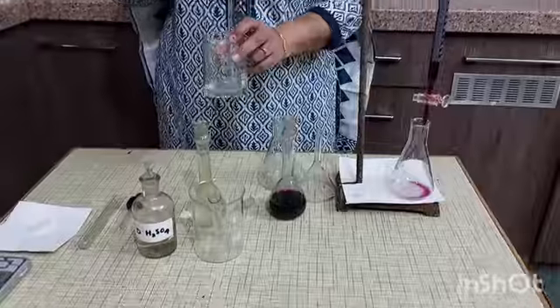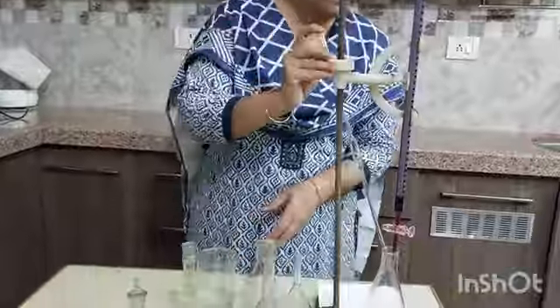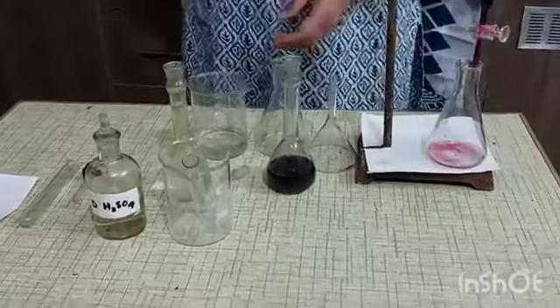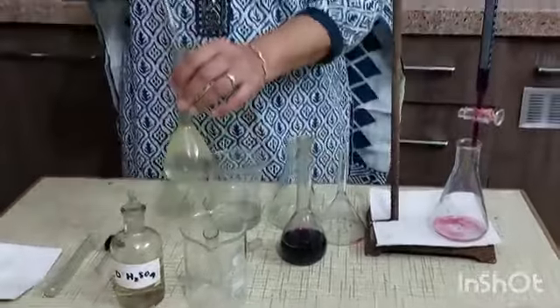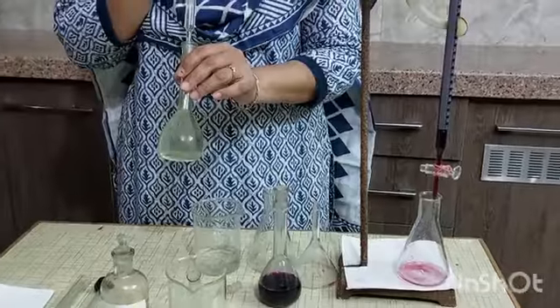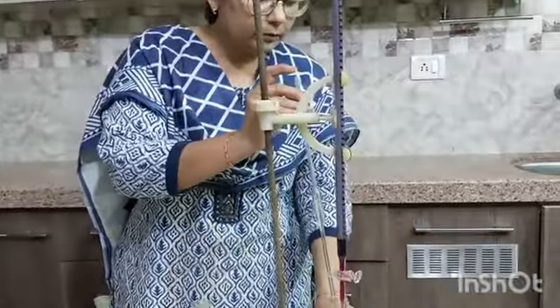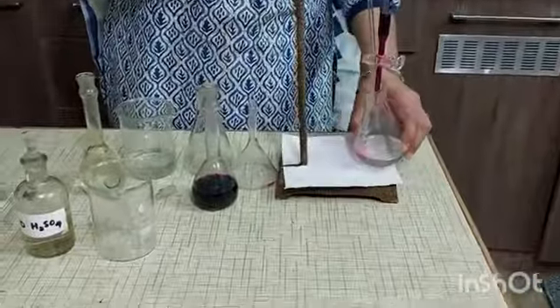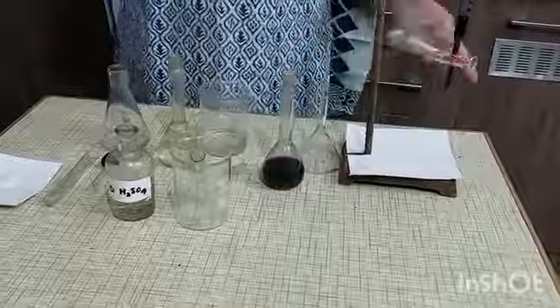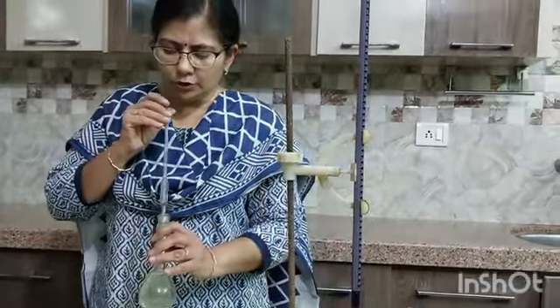Rinse the pipette with water. Then rinse with the known solution of Mohr salt. Pipette out 10 ml of the unknown solution of Mohr salt.